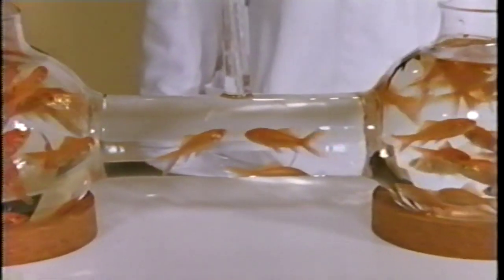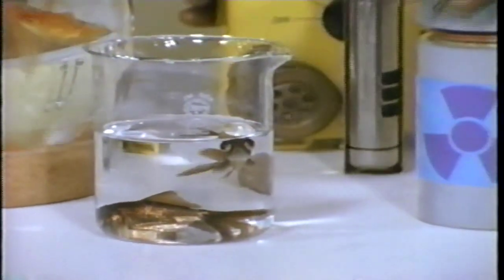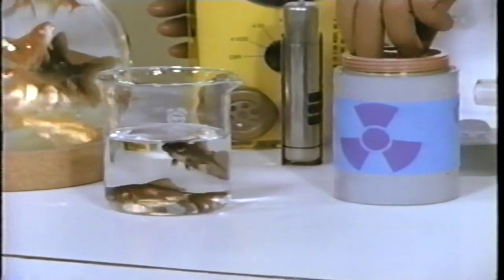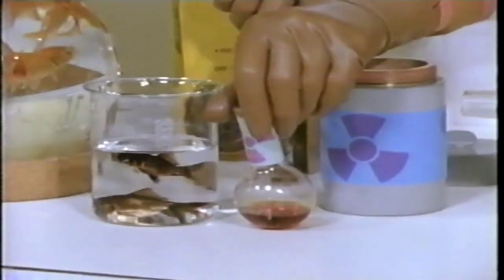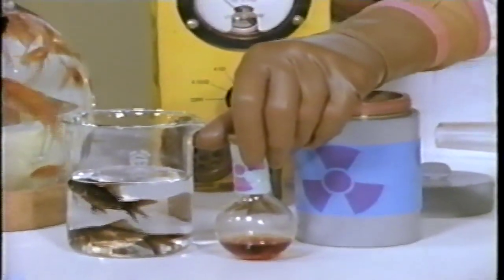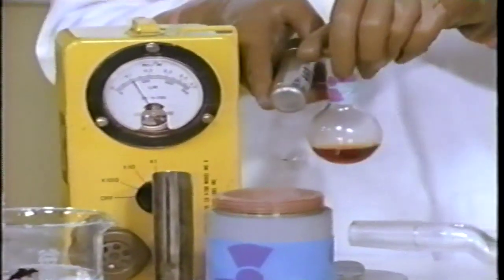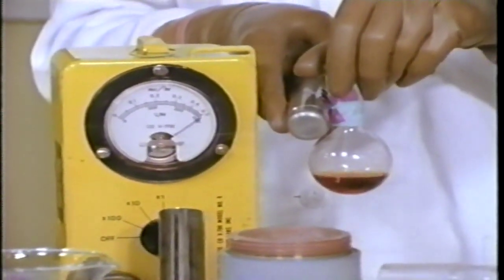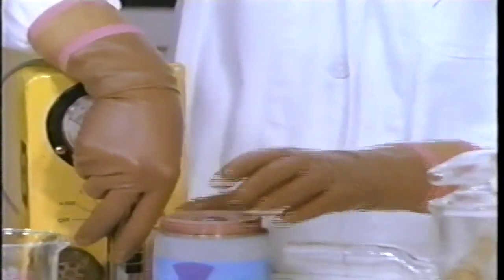concentration. Unfortunately, we can't see individual molecules, but we can track radioactive molecules, even at such low concentrations that there is no health hazard. This bulb contains an aqueous solution of radioactive bromine. When one of the radioactive bromine nuclei disintegrates, a gamma ray is emitted that reveals the approximate location of one of the bromine molecules. By detecting such gamma rays, we can follow the movements of these radioactive molecules just the way we watched the dark fish move about.